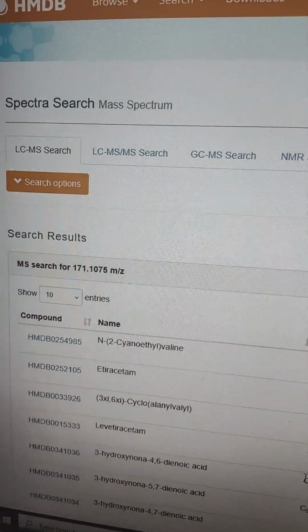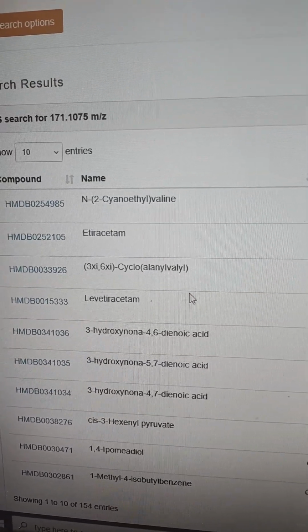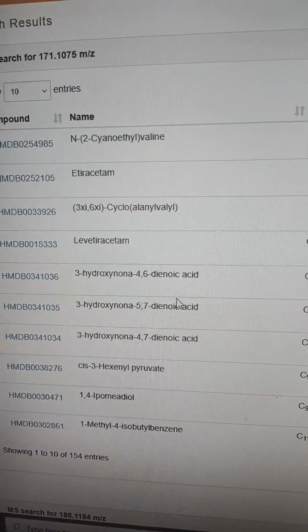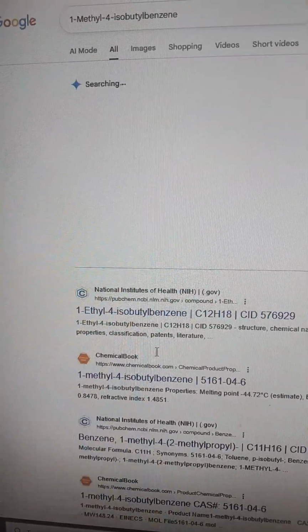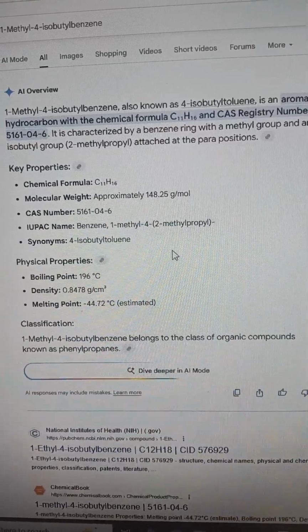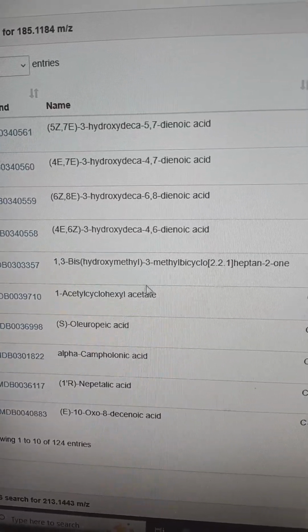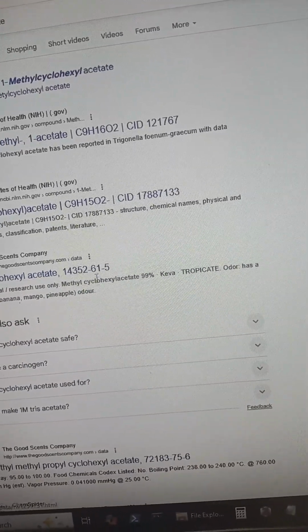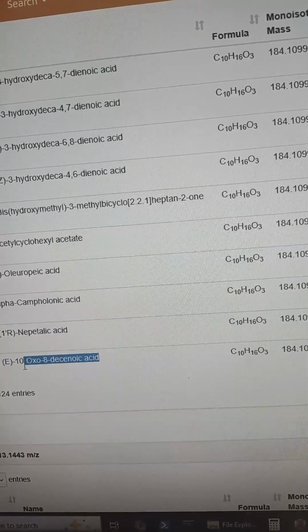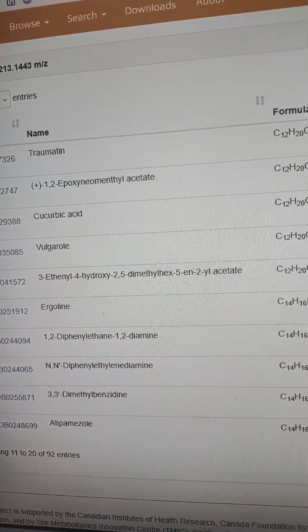All right, throw it through HMDB first, see if we can find anything. It's kind of a lot of error. I mean, this is not the best database for this type of thing. I'm not seeing anything that makes any sense. For the first one, maybe this makes a little bit of sense. We can search that, see if that comes up with anything. Don't know. Nothing really definitive here. Again, not anything great. Maybe this acetyl cyclohexyl acetate is not a bad hit. It's like a flavoring compound though, so I don't know if that makes sense. Maybe this decanoic acid makes sense. We just don't really know. And then again, not really. So HMDB is not really doing it.